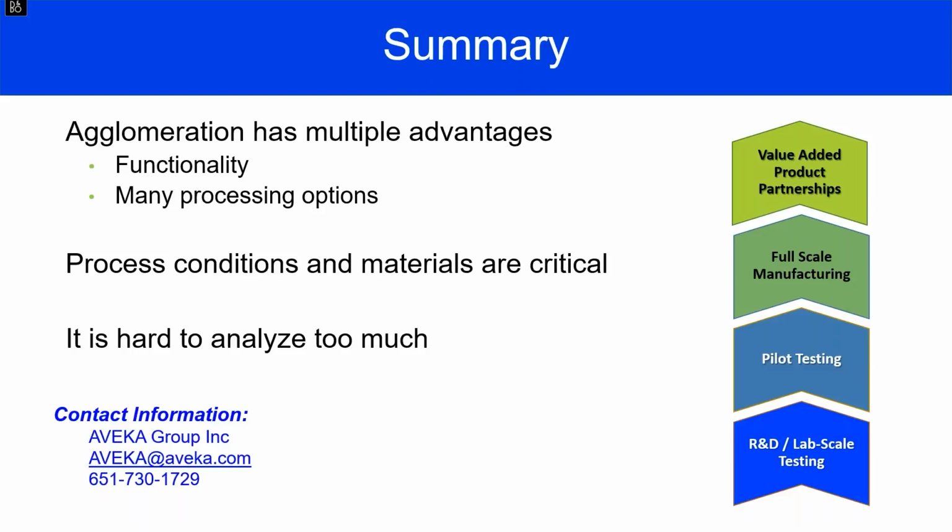I cannot stress how important the process conditions and materials are, how critical they are to getting the right product that you want. It's an incredible matrix that has to be peeled back and then continually monitored. And the way that you monitor it is by analysis. If you are taking too many particle size distributions or too many SEMs or optical images or wettability studies, I don't believe it. You can't analyze too much, and the way that you're going to be successful in this area is to understand the fundamentals. Read Litster's book, call us up, or analyze the heck out of what you're doing.